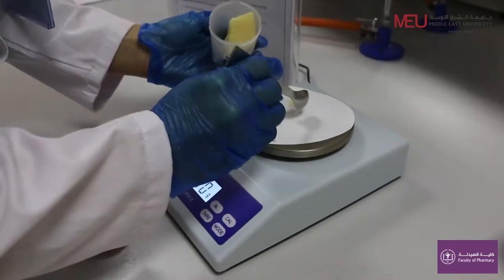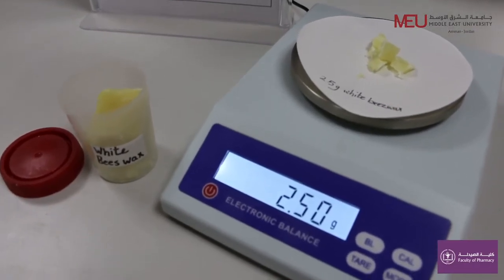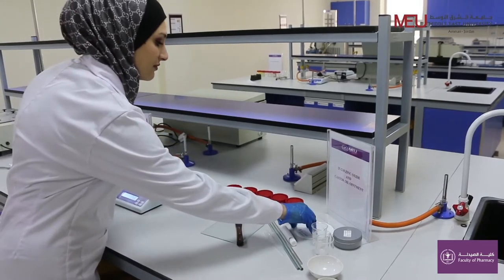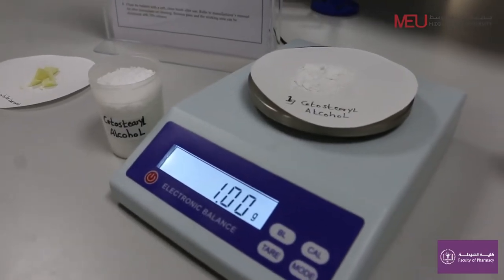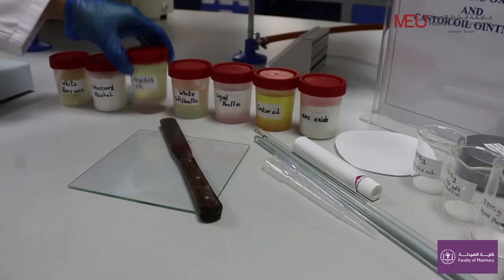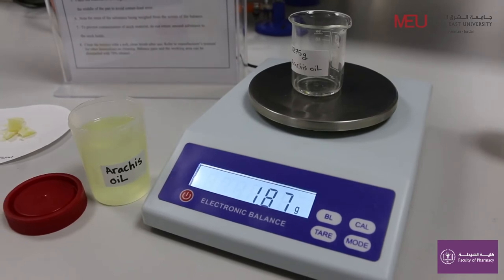Weigh 2.5 grams of white beeswax, which is used as a stiffening agent. Weigh 1 gram of cetostearyl alcohol, which is used as a stabilizer. Weigh 1.87 grams of arachis oil, which is used as a vehicle for the drug.